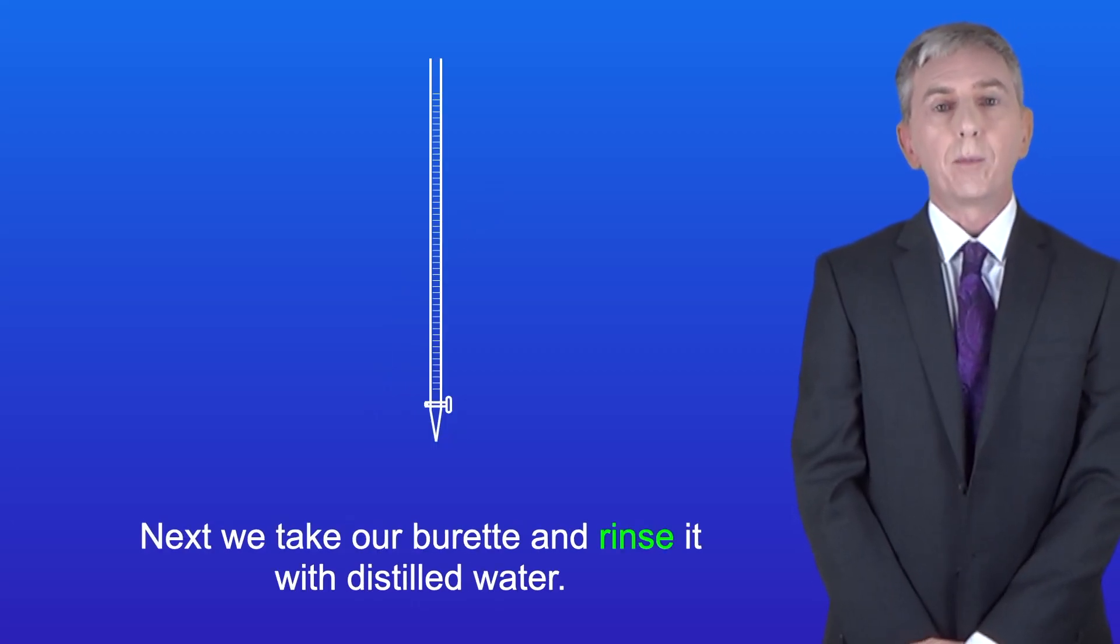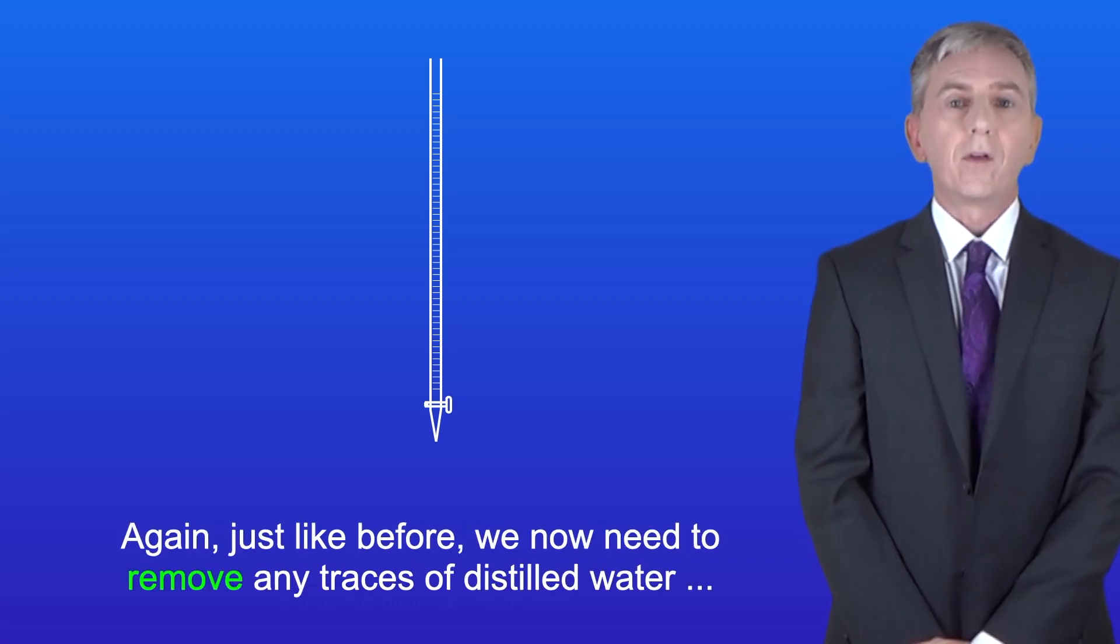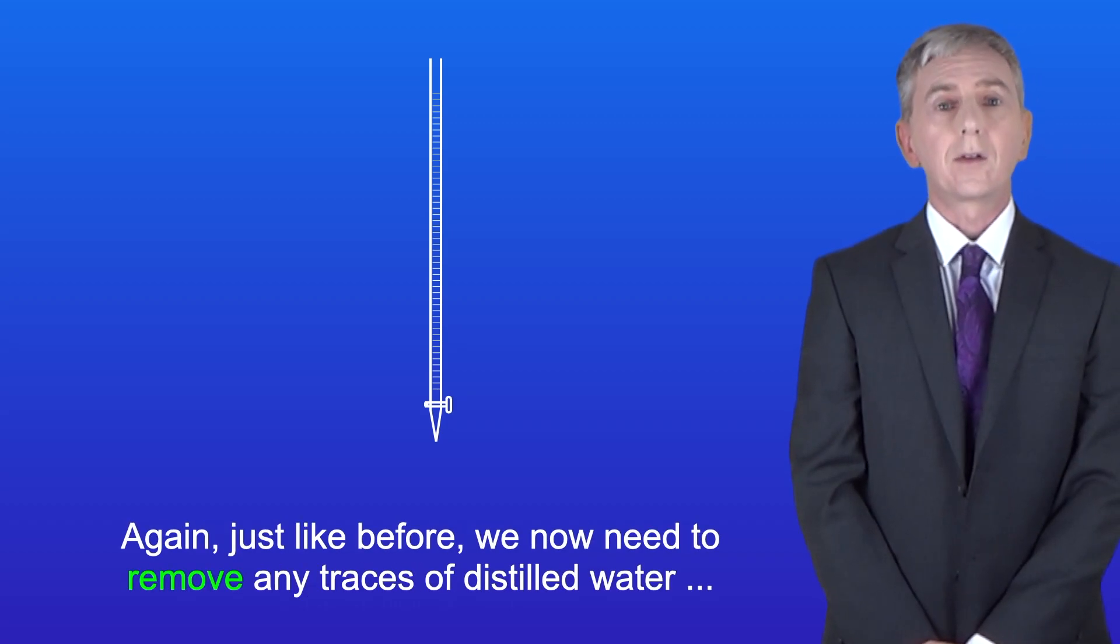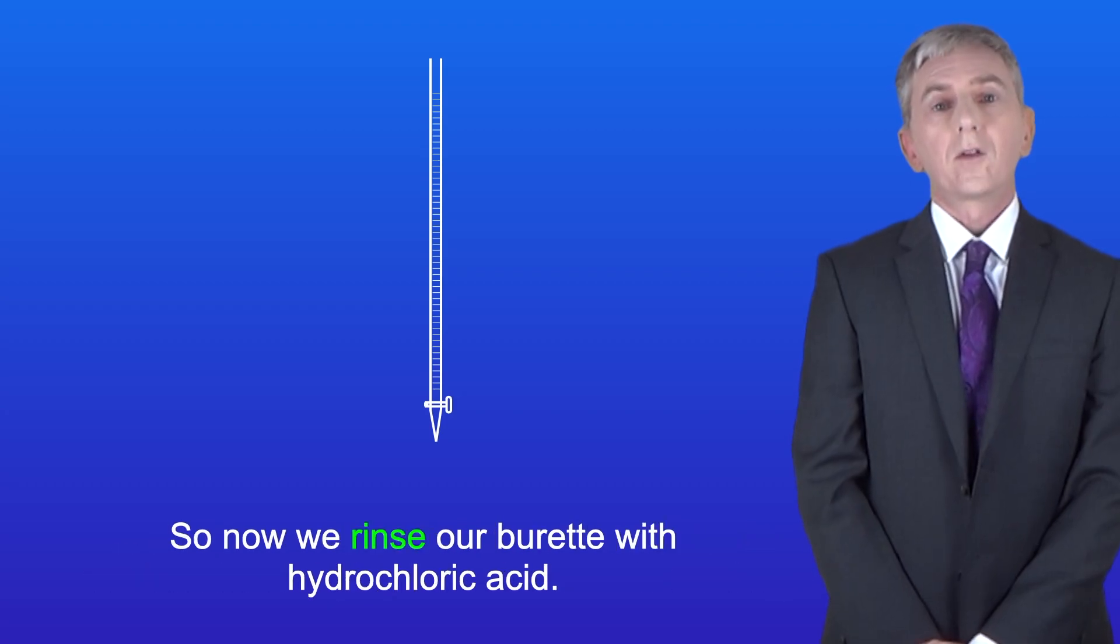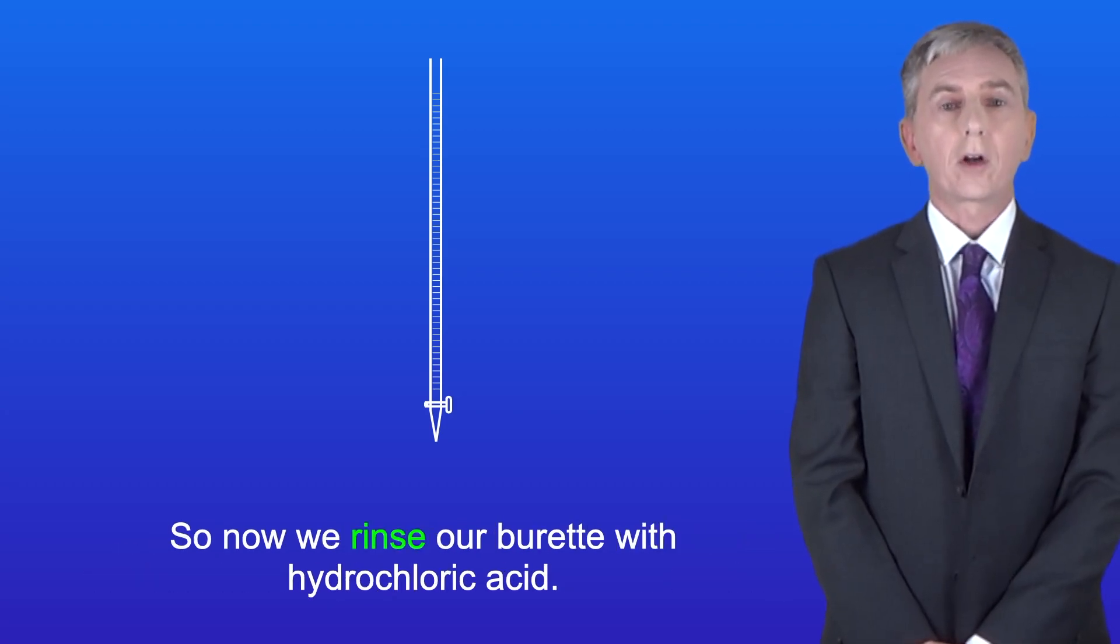Next we take our burette and we rinse it with distilled water. Again, just like before, we now need to remove any traces of distilled water, as this would contribute to the volume in the burette and give us an inaccurate reading. So now we rinse our burette with hydrochloric acid.